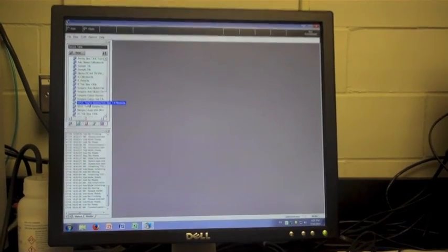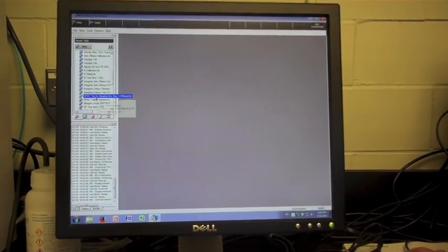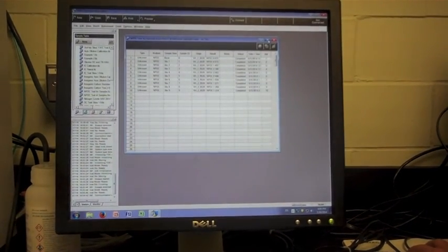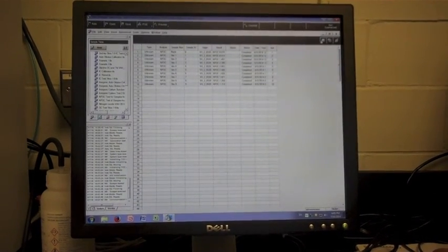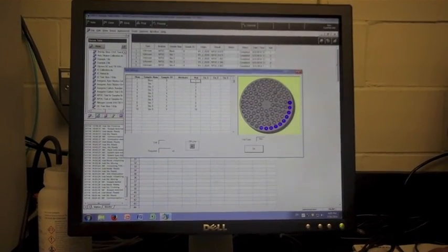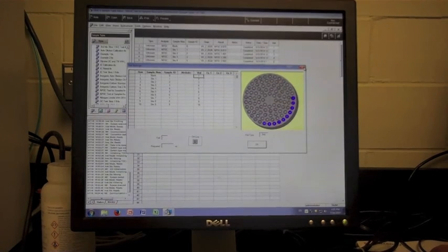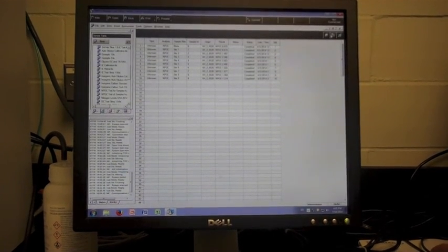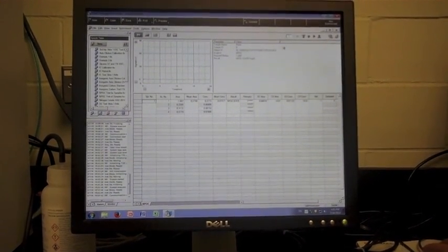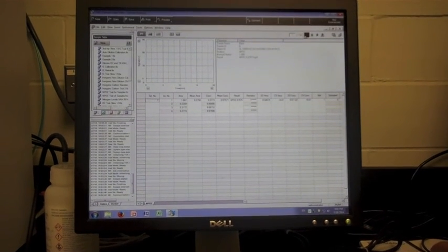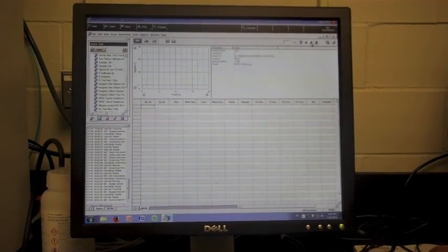In order to view the results of a sample analysis, select the file from the sample option on the left side of the window. When looking over sample analysis results, you may view the average concentration results for all samples at once in a table, or view the readings for each sample individually by selecting another option in the top right corner of the window.